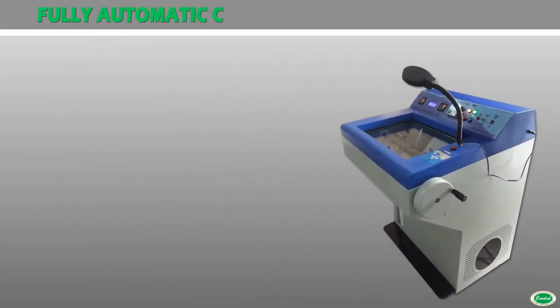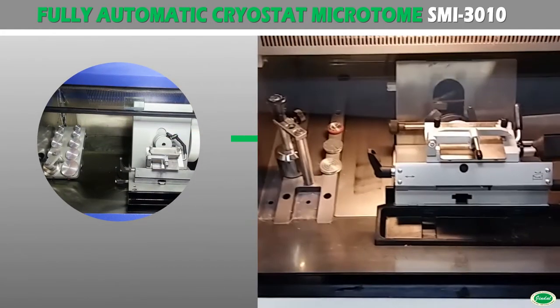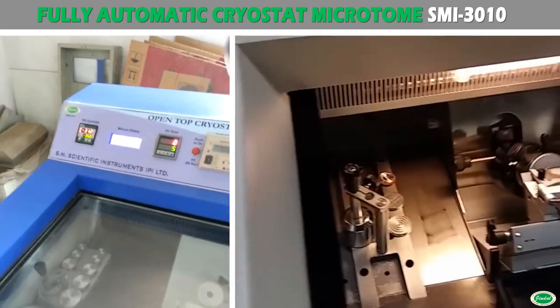The cryostat microtome provides a rapid and easy means for the sectioning of natural tissue from 2 to 20 microns in steps of 2 microns without distortion, for high quality microscopic examination. The outer body of the cryostat microtome is made of mild steel, dually powder coated.